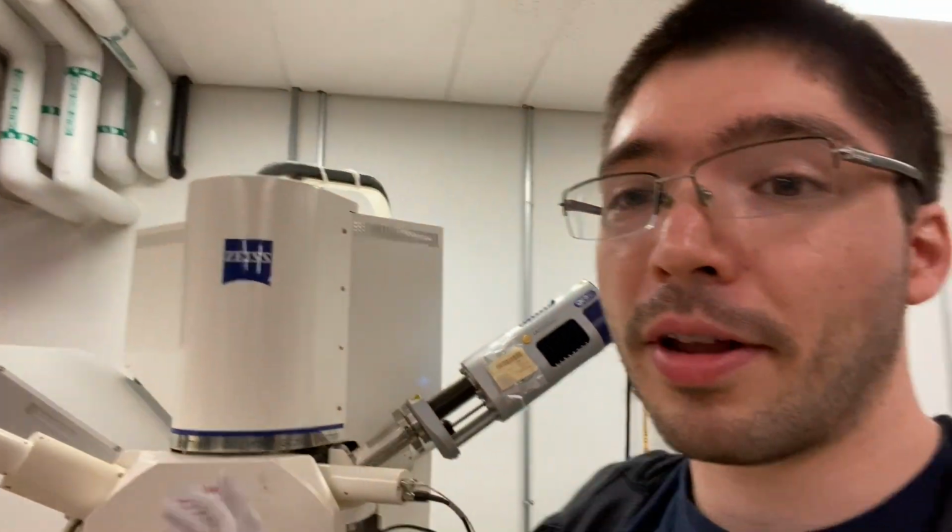It might sound a bit complex, and it is, and that's because it's a very difficult process. I've been doing this for 6 years, and I still sometimes have trouble learning certain things and trying to keep things in my head about specifics regarding the SEM itself, but there are a lot of really useful books out there.